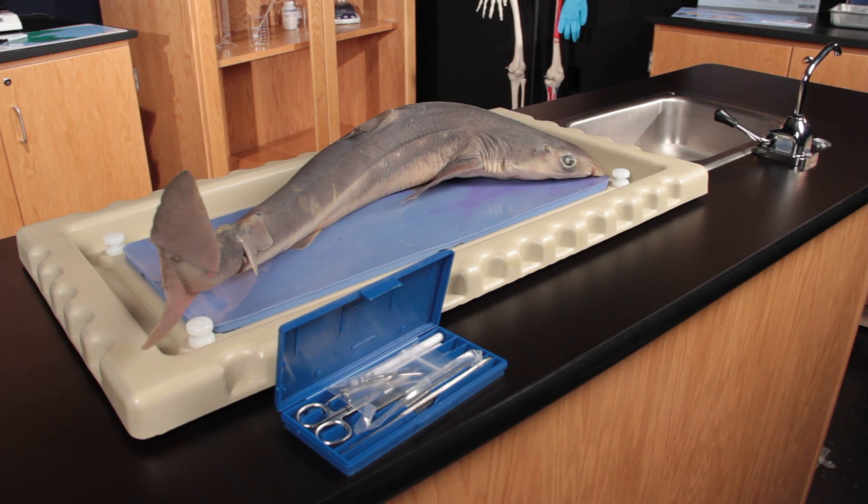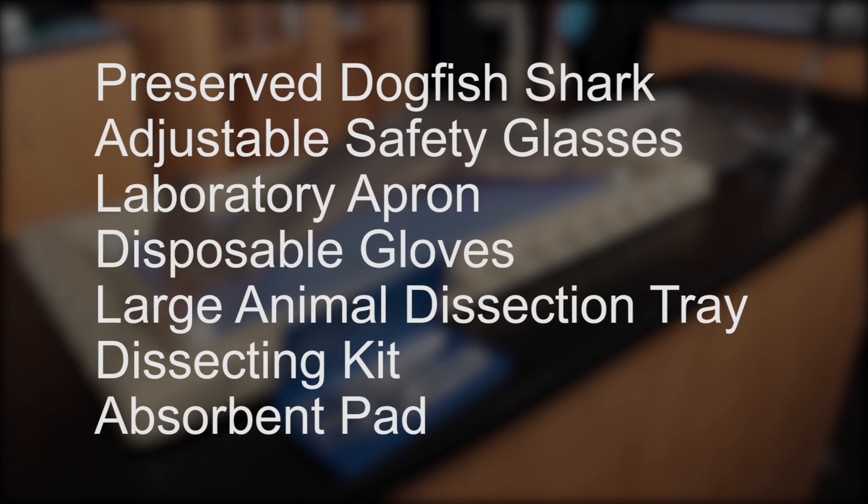For this dissection, you will need a preserved dogfish shark, adjustable safety glasses, laboratory apron, disposable gloves, a large animal dissection tray, dissecting kit, and an absorbent pad.